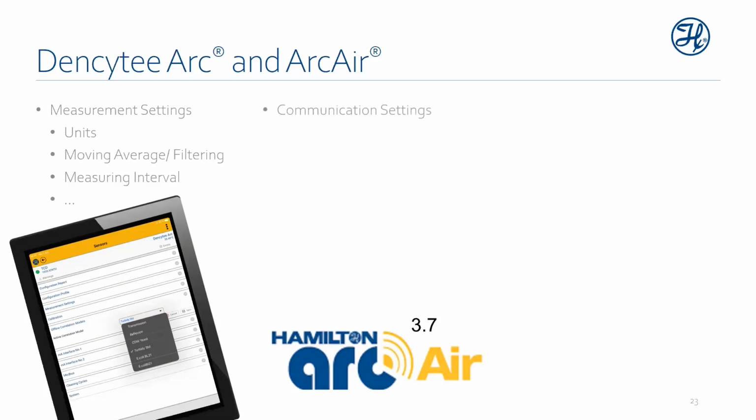In addition, with the sensor itself, you can configure communication settings within it, as well as, if you really want to, you can also validate that your sensor is within conformity. So we have those abilities to essentially confirm that the sensor is configured properly for connection to your process control system.